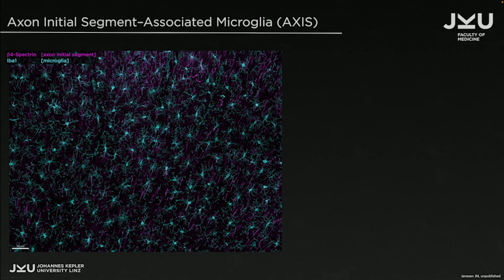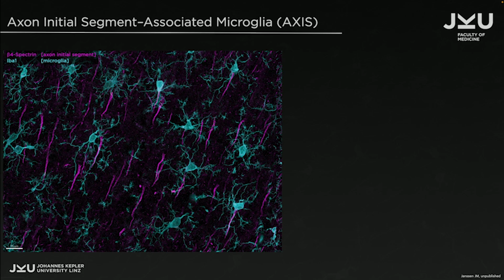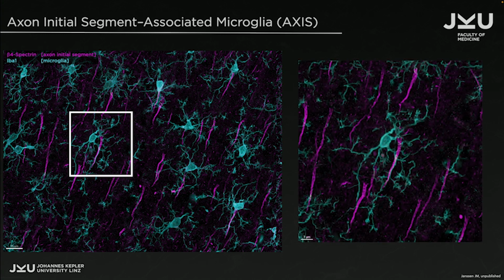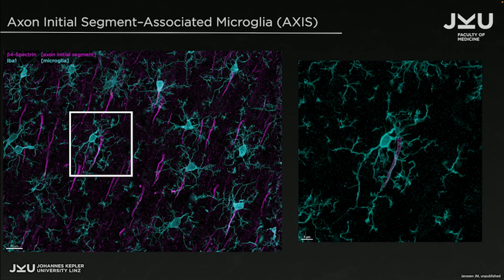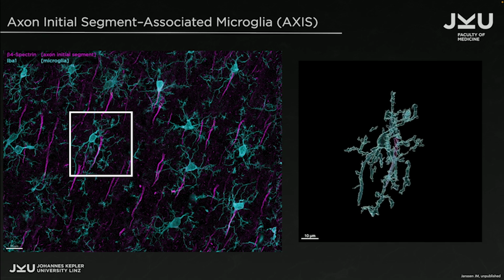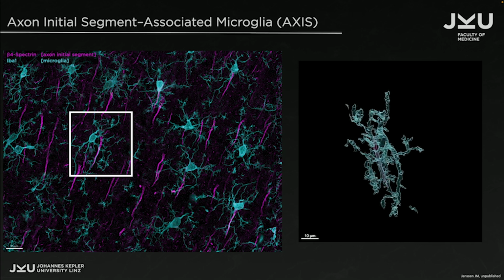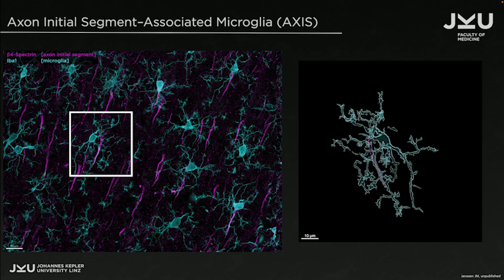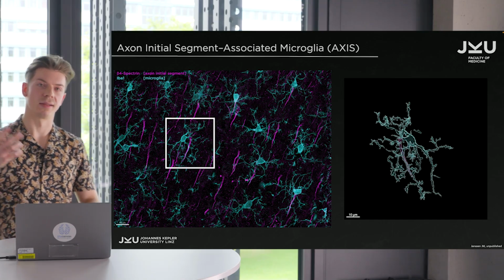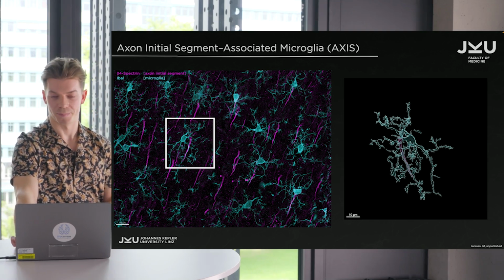And it could be shown that there are preferential contacts of microglia alongside the AIS, and by taking optimized confocal images and 3D segmentation, we can measure and quantify these interaction sites and see if they change in their size or in their frequency in models of heightened excitation, like, for example, epilepsy or after spinal cord injury, where our cells within the brain are still intact even though the axon far down in the spinal cord has been cut.